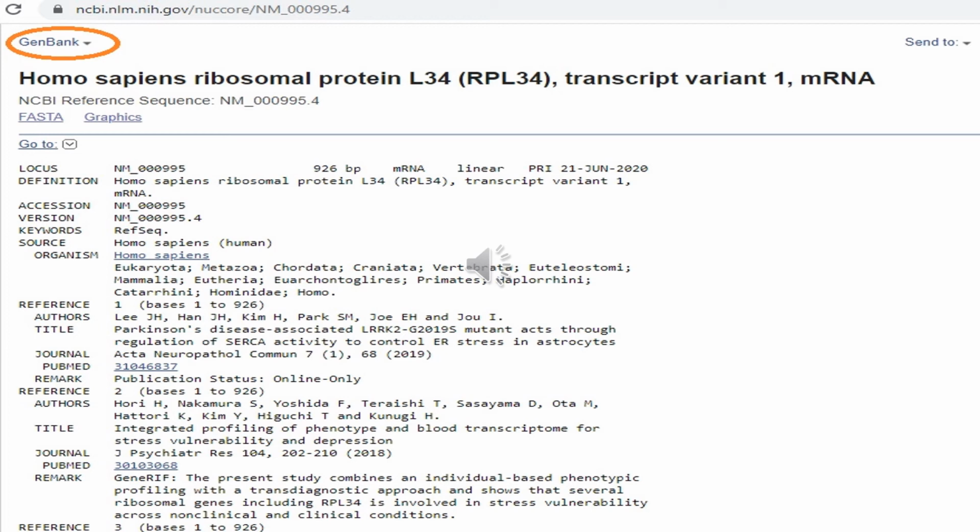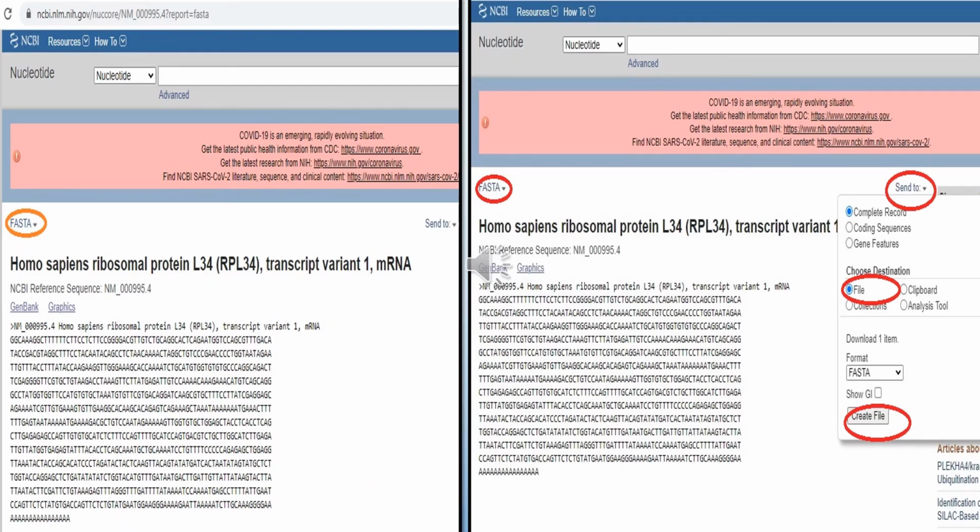If you want to see this particular sequence in a simpler format, you can convert them into FASTA format. So in this slide, I am showing you FASTA format of the same sequence. If you see properly, you can see that the sequence is very simple. Means in FASTA format, the sequence is very simple. It only starts with a greater than symbol followed by a description line. After the description line, there is no other description. It directly starts.